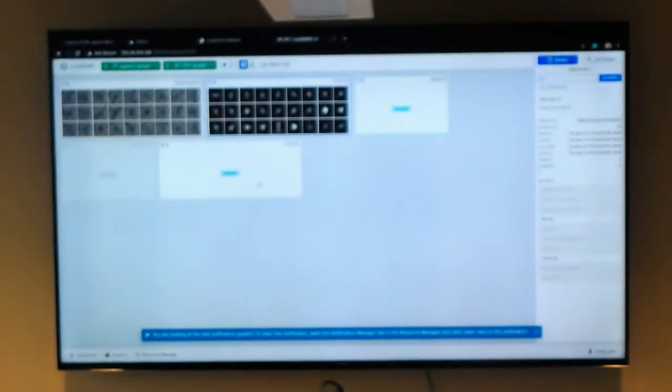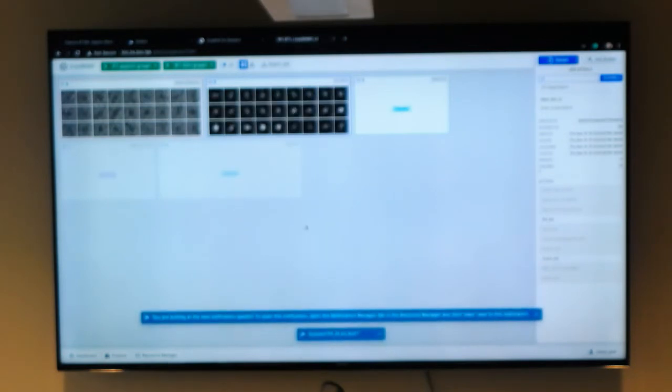Okay, so I want to get you used to the interface. You can start poking around. CryoSPARC is a very friendly web interface. The tutorial has a standard workflow that we're going to have you do, which is very similar to RELION: 2D classification, ab initio model generation, 3D classification. In this sense, you'll do heterogeneous refinement, and then you can do homogeneous refinement for that 3D refinement.